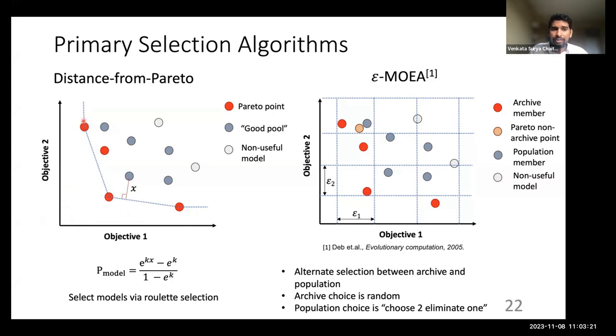So we will get a Pareto front of structures, where some structures will have very high energy, but they match well with the experiments. And some structures will have very low energy, but they have very high mismatch with the experiments. So we take all these structures as potential solutions, and we can use these structures to further evaluate the phases.